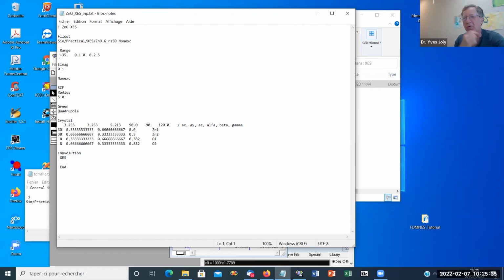Okay, no more questions. So I thank you for your attention. Usually I don't give my tutorial in this way. It's direct with people, so it's not at all this kind of tutorial I do, because I'm around the people, they do the calculations themselves. So I think it's better to learn. Here it's a bit complex maybe.